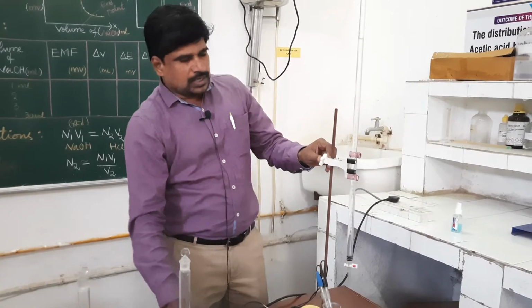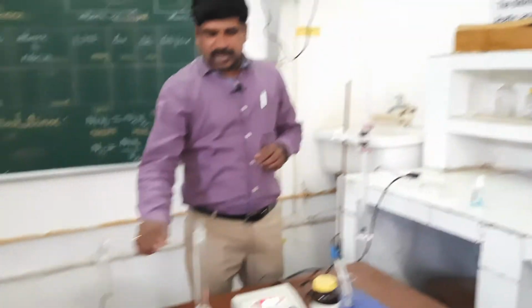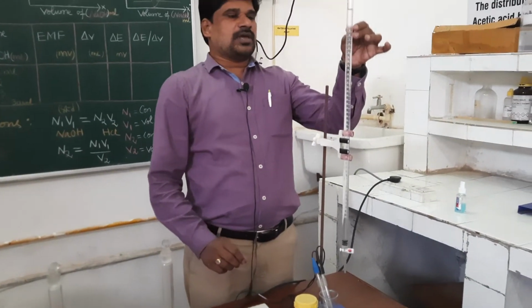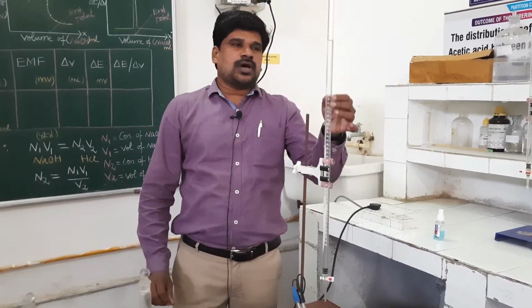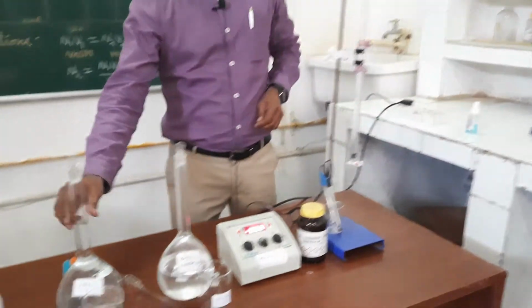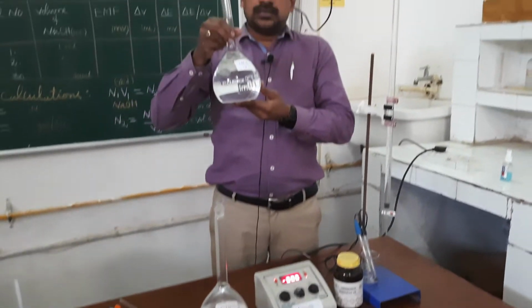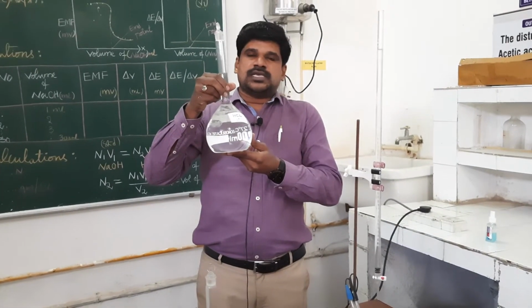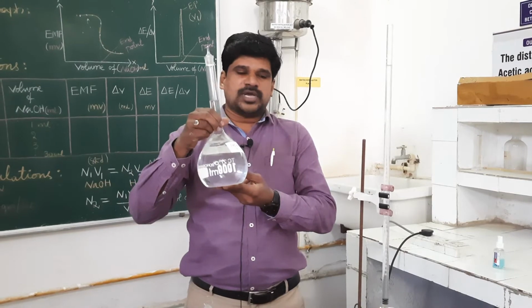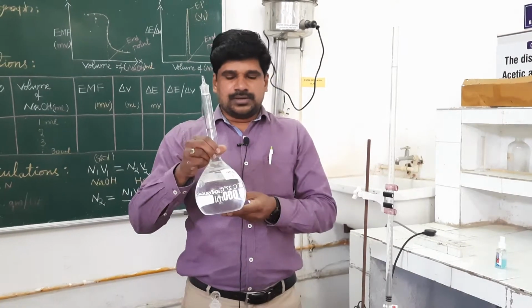First of all, let us take the sodium hydroxide into the burette. Fill the sodium hydroxide in the burette up to the 0 mark, and then take the HCl. The concentration of this HCl is unknown, so we have to find out the HCl concentration by using the potentiometer.